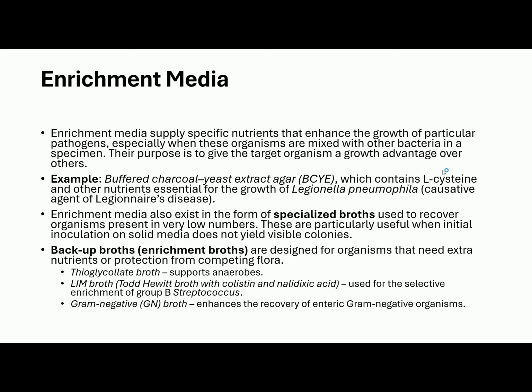A good example of this is the buffered charcoal yeast extract agar, or BCYE, which contains L-cysteine and other nutrients essential for the growth of Legionella pneumophila. This is the causative agent of Legionnaire's disease. Legionnaire's disease is a pulmonary disease. And commonly, Legionella is usually found in air conditioning cooling towers.